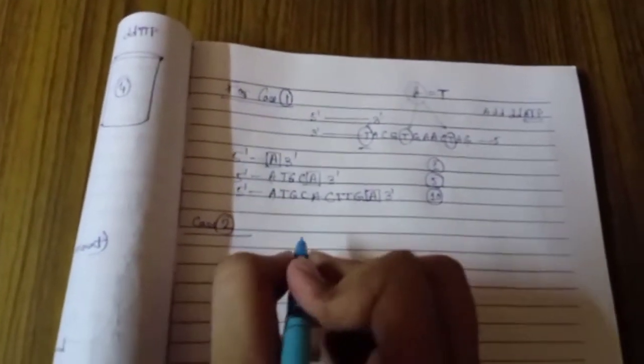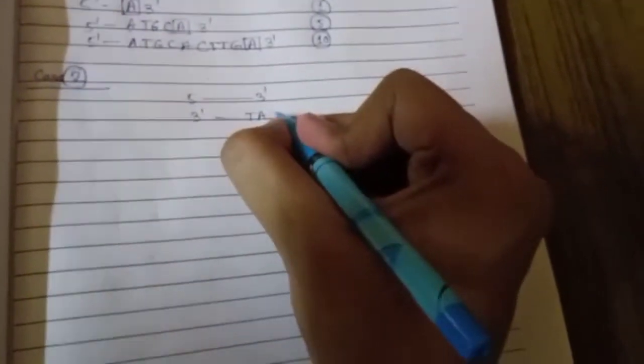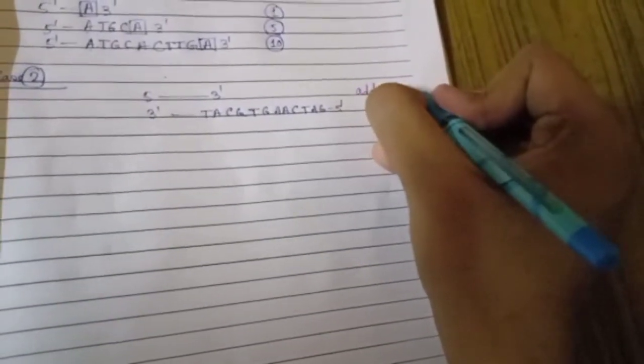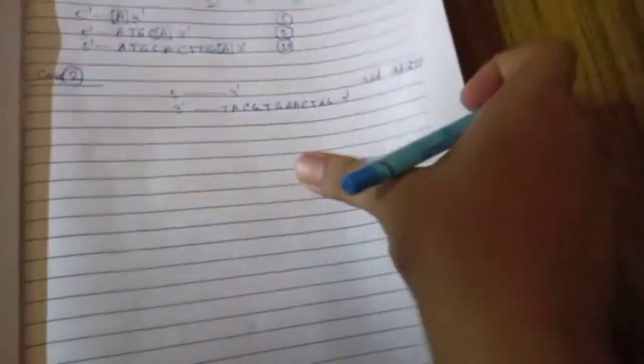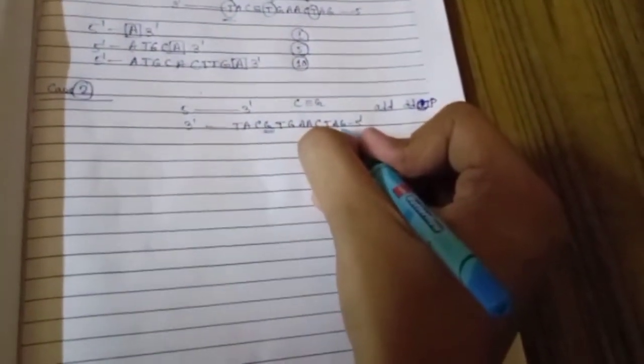And for case 2, in every case we have to write the strand which we want to sequence, and in case 2 we add ddCTP as the dideoxyribonucleotide, and we know that cytosine pairs with guanine.